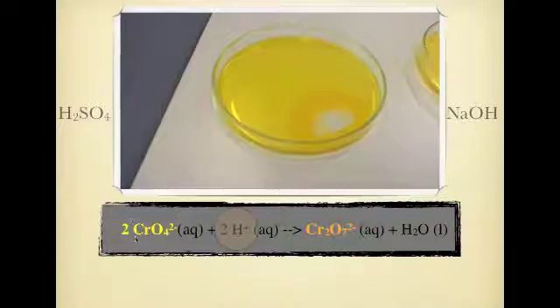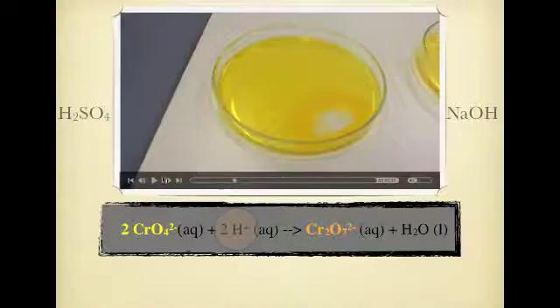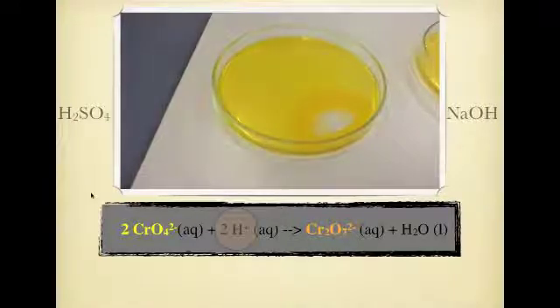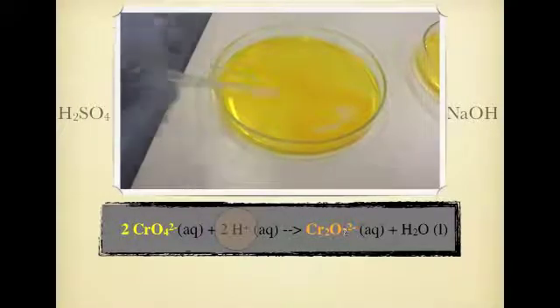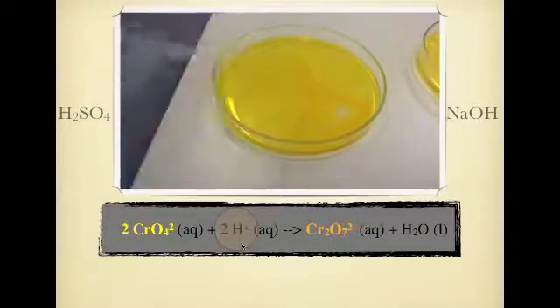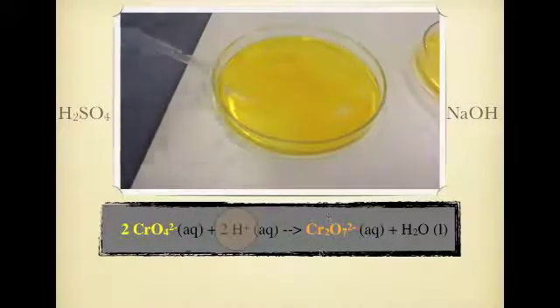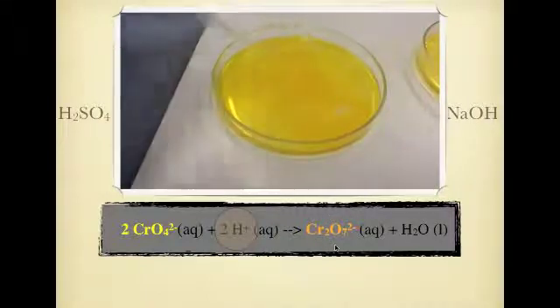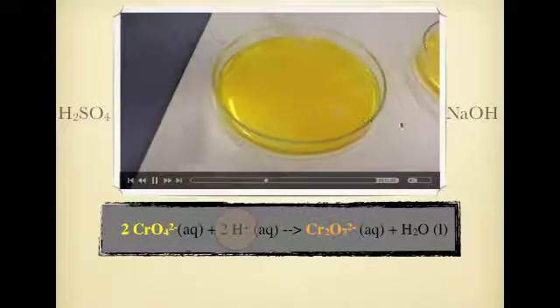The hydrogen ions that I'm adding to it are going to react with this chromate and form more of the orange dichromate, and you can see as I start to stir it around, they have a very similar color, but once you can tell it's a bit more orangey than the other one. So the equilibrium is being shifted to the right because we've had an increase in our reactants, or at least one of our reactants. So therefore we're making more of this stuff here.